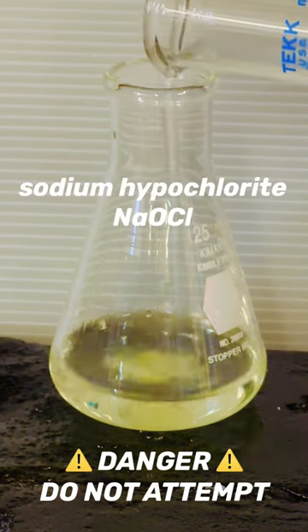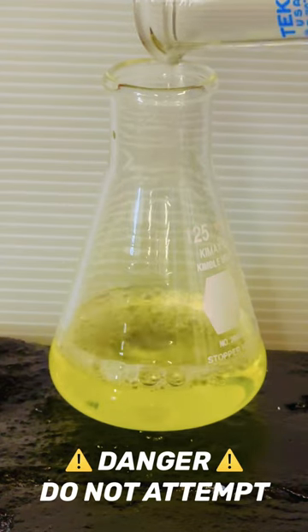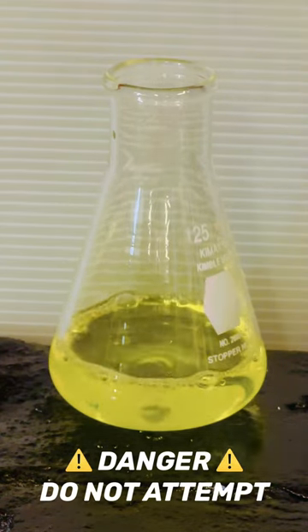This flask contains a solution of sodium hypochlorite, which is found in bleach. When acid is added to this solution, a yellow vapor is formed.